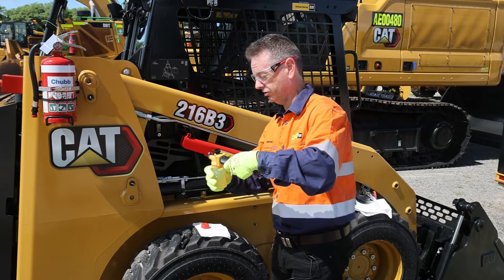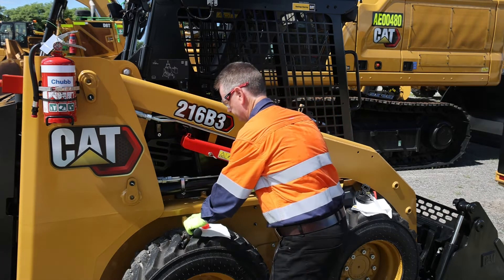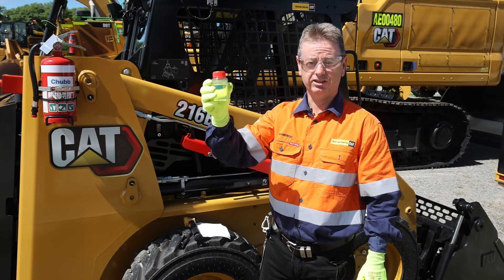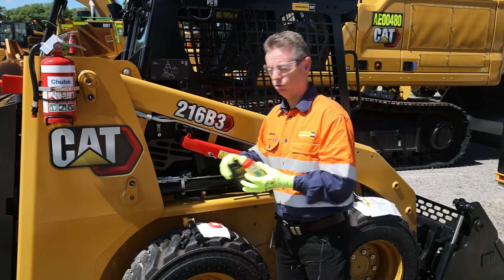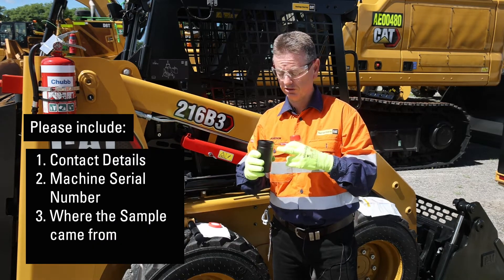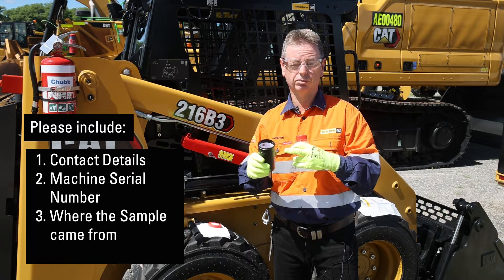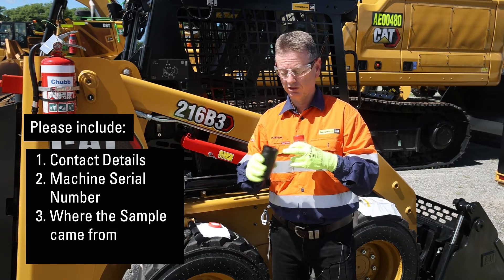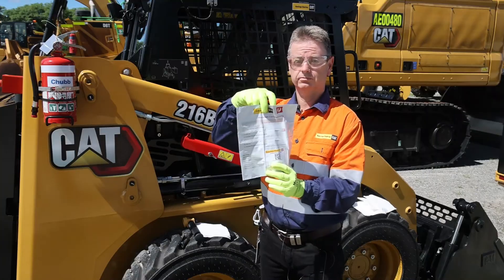Remove the sample bottle after taking the sample and put the lid on straight away to keep it clean — one clean SOS 18 diesel sample. Make sure when you take your nice clean sample, there's paperwork inside to fill out. We want to get the correct information on that. Most importantly, please put contact details and a phone number so we know who to get hold of. Place the sample in the container, place it in the mailing bag, and send it off to Hastings Deering.